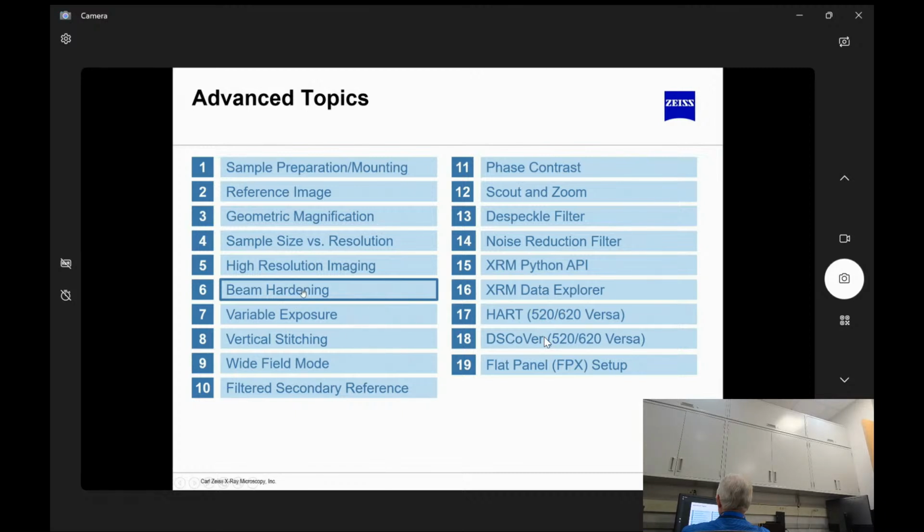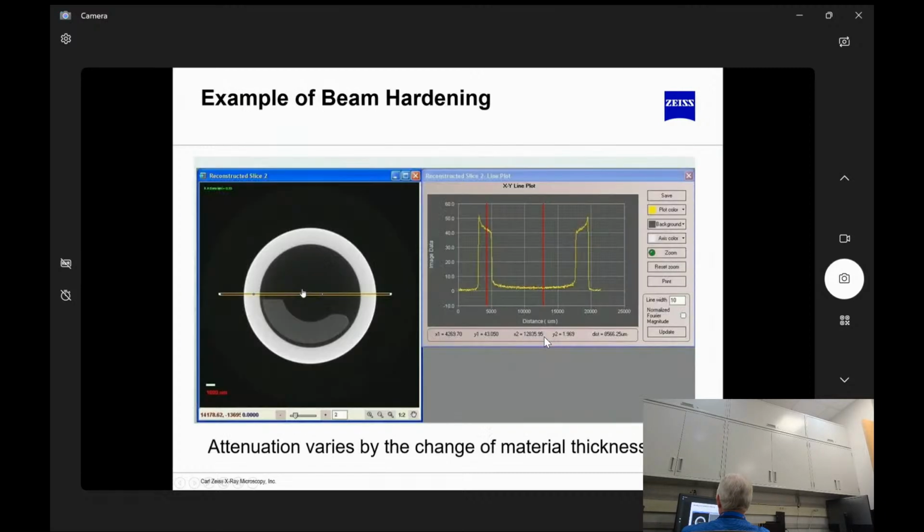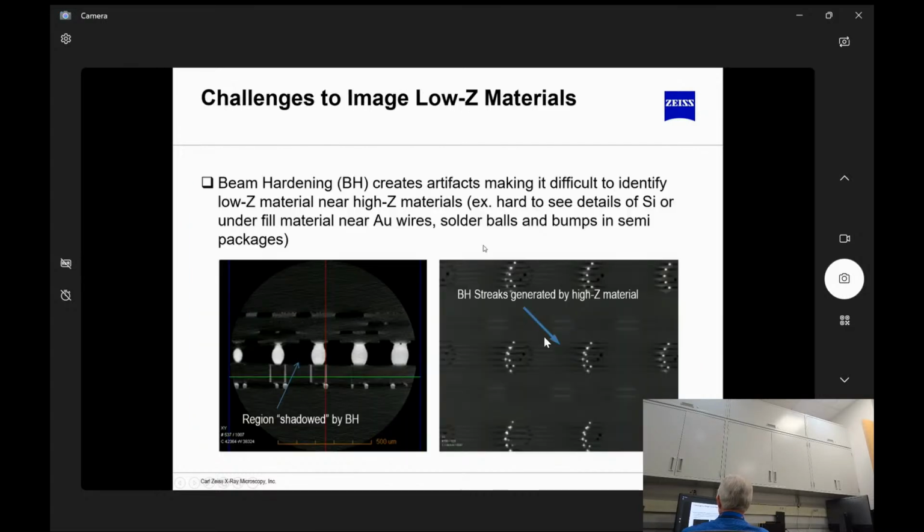Beam hardening, we've talked about. Its correction is something that we can do in real time. I can shift the applied beam hardening correction over a few projections, or a few rows of pixels, and determine the best for that particular application.